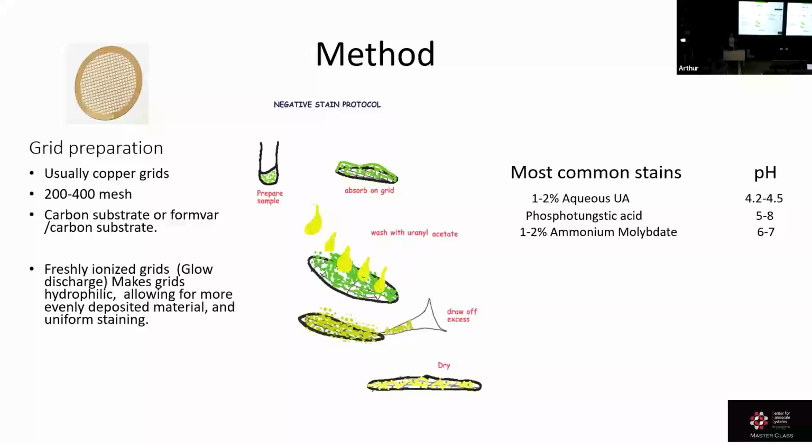It's not likely that you're going to have a situation where one stain will work and the others will show nothing. Usually you're getting a situation where 2% aqueous solution works, but you'd see if you can get a little bit better resolution, so you might try another stain.